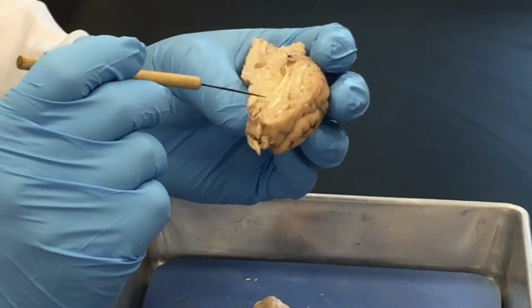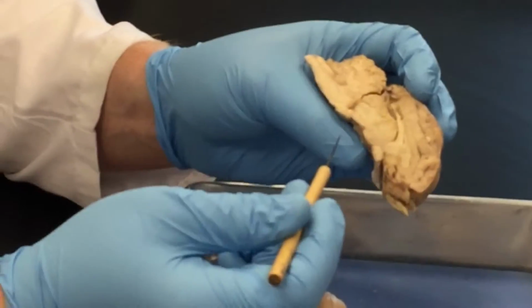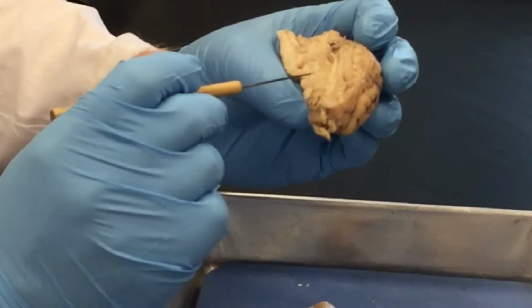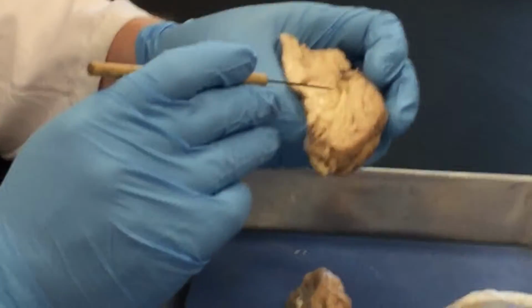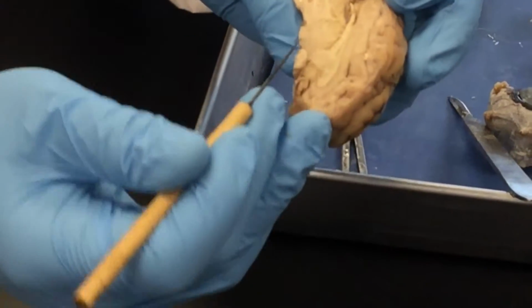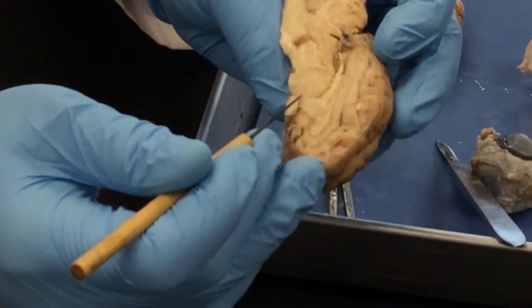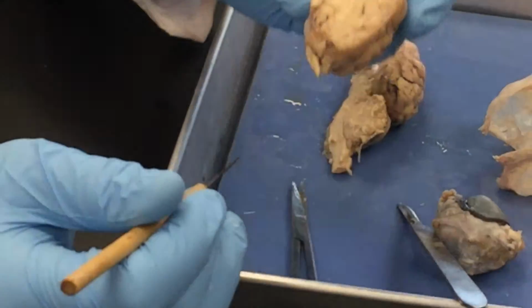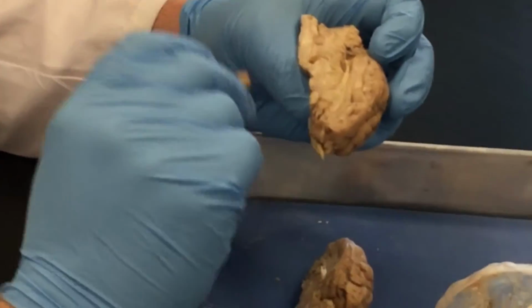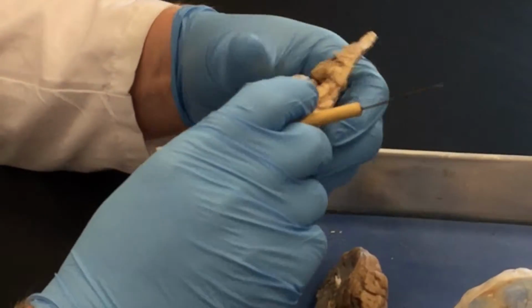Yeah. Okay. I mean, look. There's the fourth. That's pretty hard to distinguish. So don't worry about it. And the third, we pretty much cut in half. So this round structure right here in the middle, that's the thalamus. And just below here, that's probably one of the best hypothalamuses I've seen. In here, you can see it kind of changes color a bit as well. Okay, so thalamus, hypothalamus. I think that might be it.